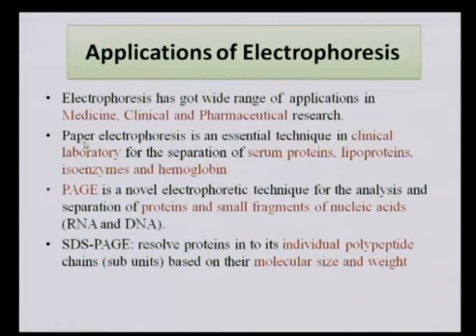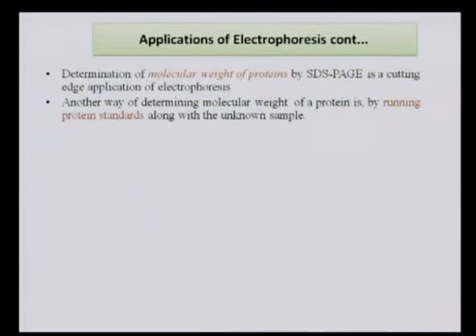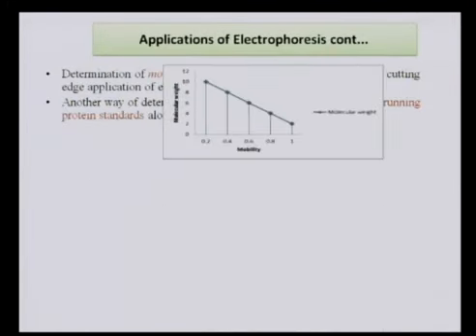Apart from that, paper electrophoresis is an essential technique which we use in clinical laboratories to separate proteins, isoenzymes and hemoglobins. And PAGE is useful for the separation of small fragments of nucleic acids. And as we said, SDS-PAGE is useful for the separation of proteins based on size.